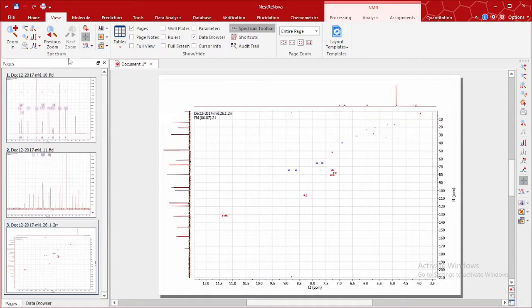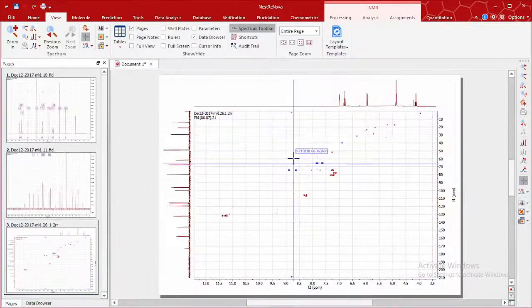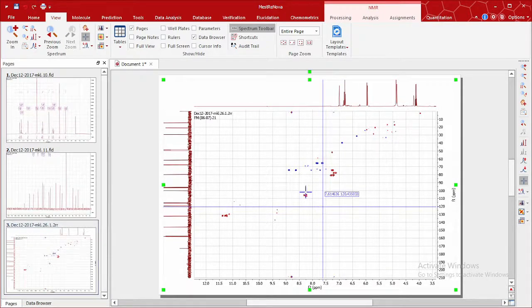So you can use this plus to navigate to each of the points. You can increase the intensity by simply scrolling. Anywhere you drop the cursor is where it is going to increase the intensity. If you put the cursor here and increase the roller, it is simply going to increase the intensity. The same applies if you put your cursor in the middle.